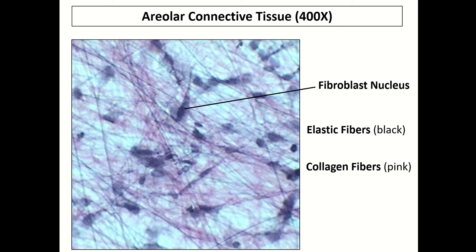In the second video, we're going to be taking a look at connective tissue slides that you're studying in lab this week. So to begin with, we're looking at areolar connective tissue, sometimes called loose areolar connective tissue, because this is going to denote it from the different dense types of connective tissue that we will also study in the lab. So areolar connective tissue is a great place to start because it shows you a number of factors that we're going to see in most connective tissue types.